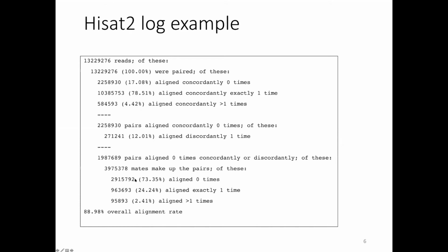And here you get the overall alignment rates.